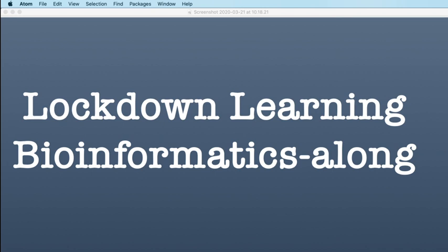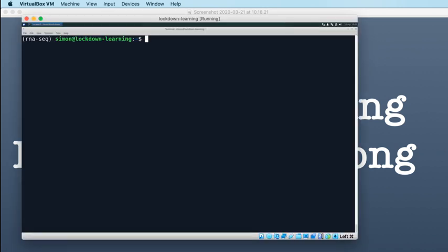So the first thing I'm going to do is pull up my VM, which is running, and I'm sat in my home directory. I think my present working directory is my home directory, and all of my data that I've got is currently sat in my week 4 directory in my share. And if you remember, we started working yesterday in the week 5 directory because it's week 5. So that's where we started putting our work yesterday.